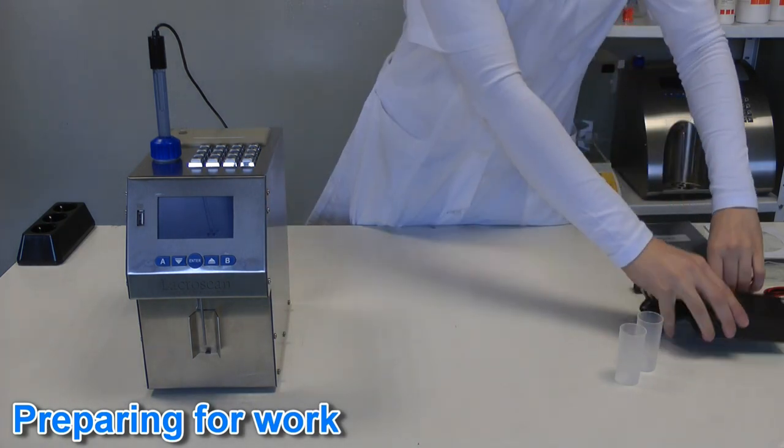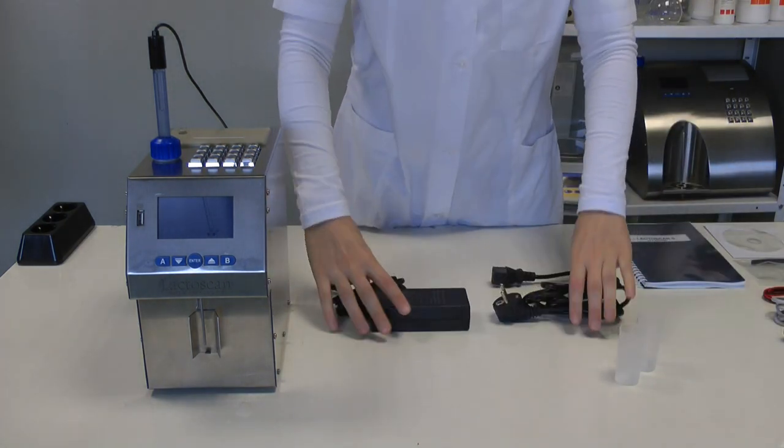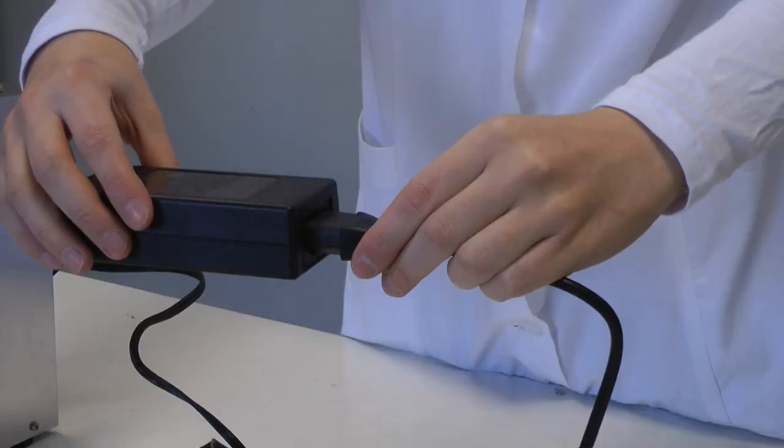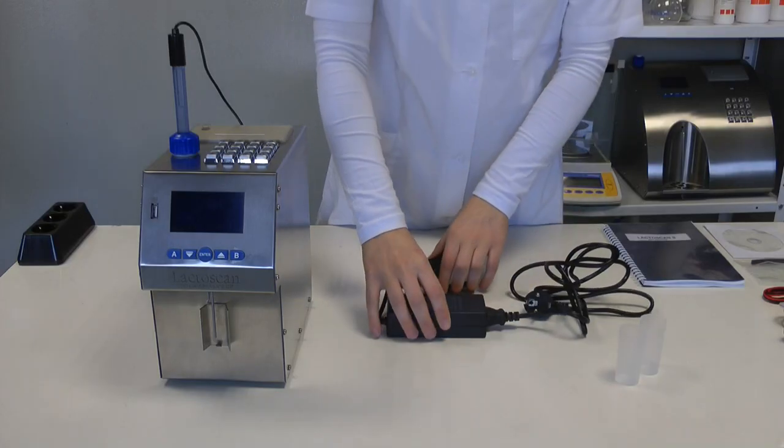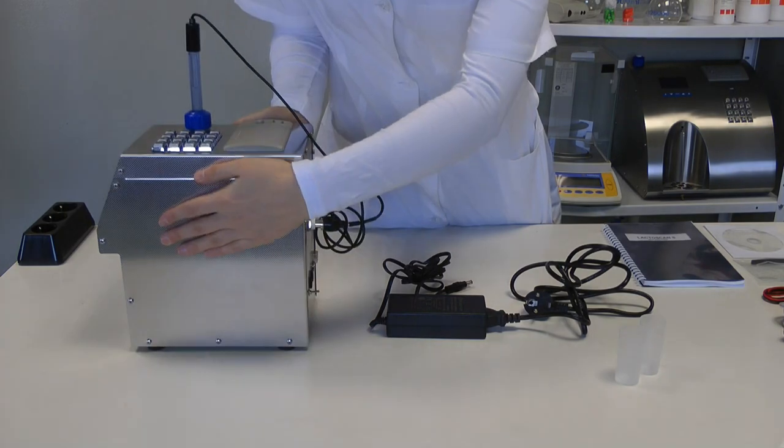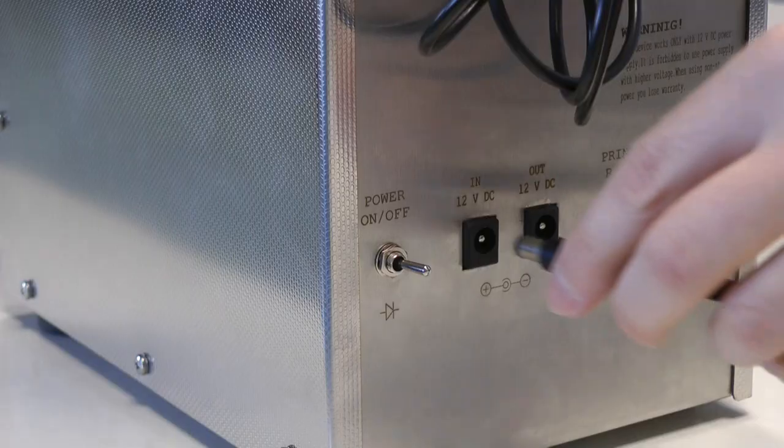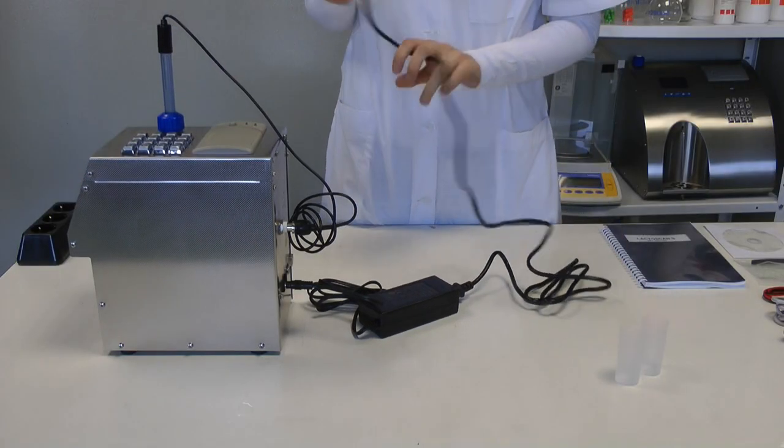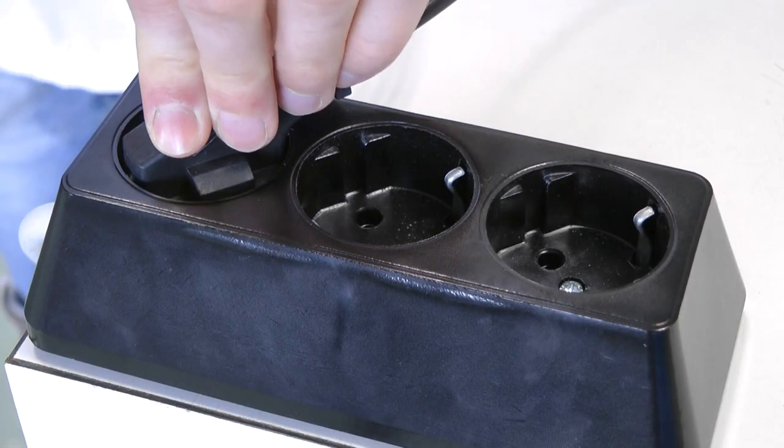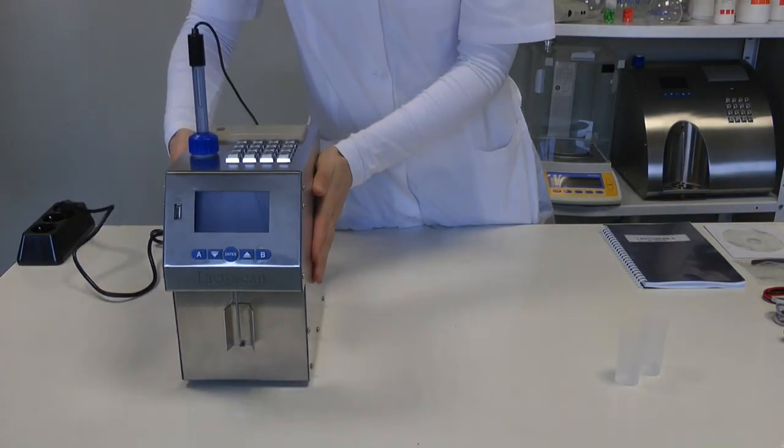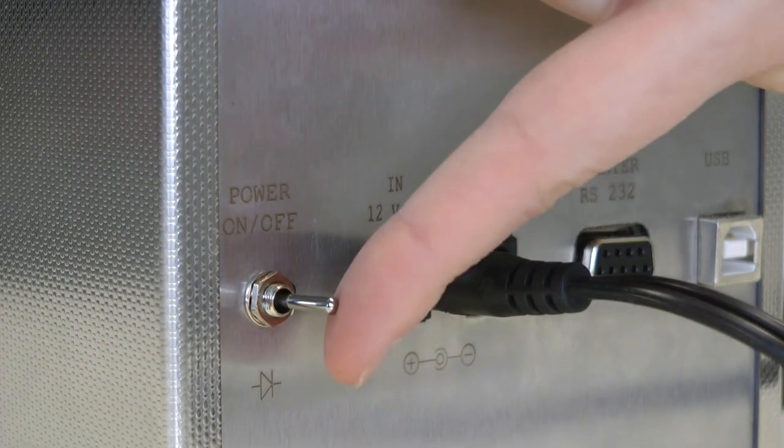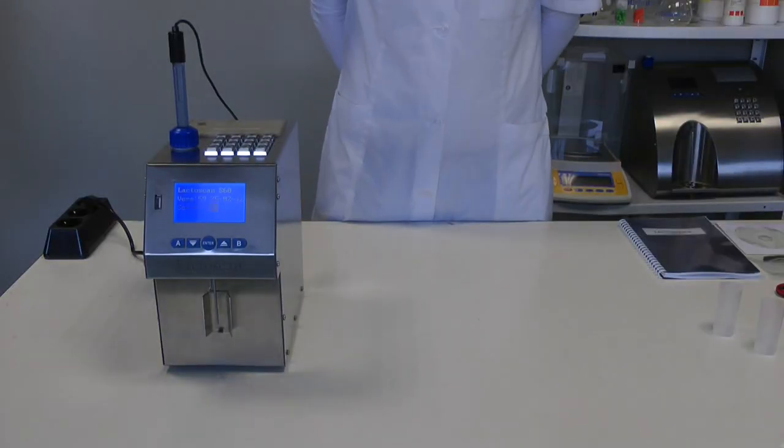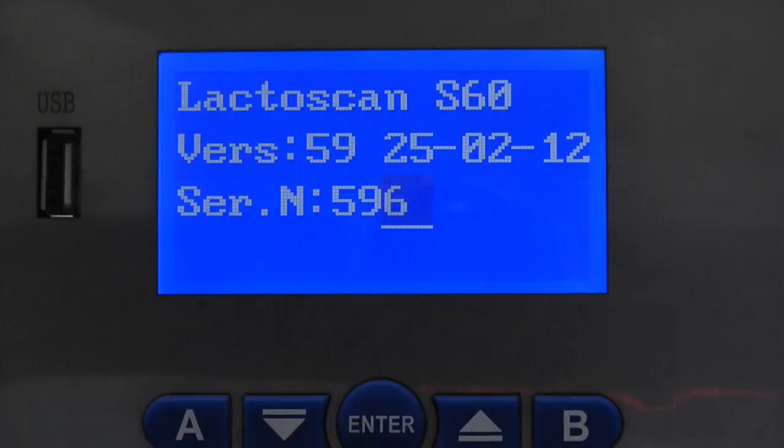To prepare it for work, do the following. Connect the power cable to the switching adapter. Plug it in the 12V input at the rear panel of the analyzer into the electrical network. Switch it on using the power switch at the rear panel. For a short period, the display shows the identity of the analyzer, its model, version, and serial number.